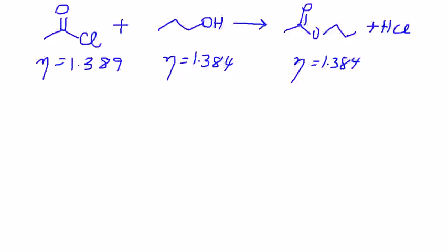So again, couple things, you are going to run this reaction in the hood because HCl is your byproduct, and that means that you guys are going to work in groups of 3. Alright, let's take a look how the reaction proceeds.